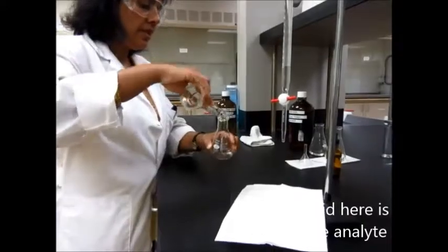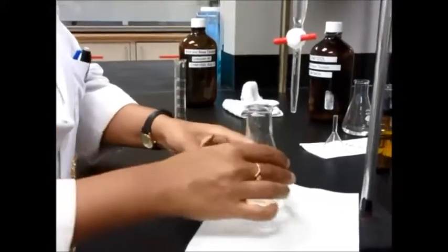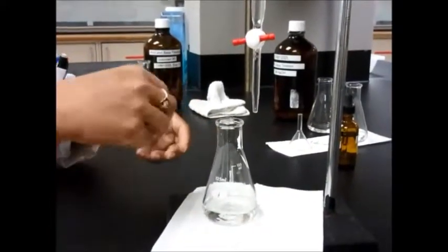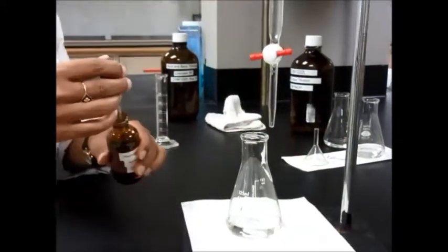We typically use an Erlenmeyer flask for titrations because it gives better control and there is less splattering. The control refers to the shaking of the flask during the titration.